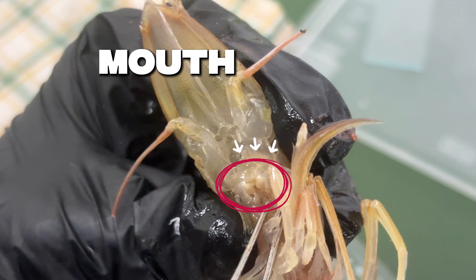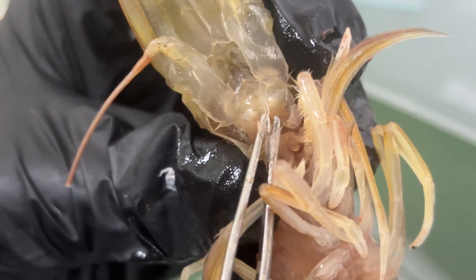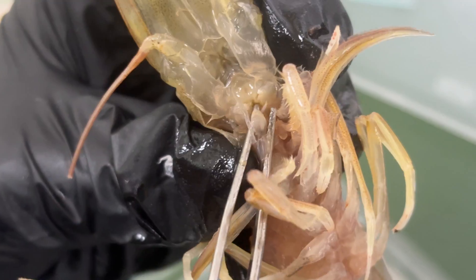Here is the shrimp's mouth. Located under the head, surrounding it are small feeding limbs — mandibles, maxillae, and maxillipeds — that help break and push food into the body.